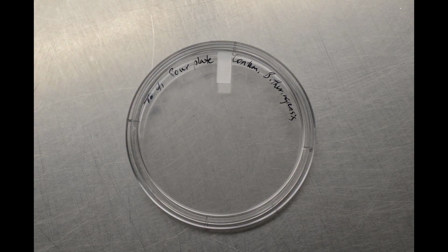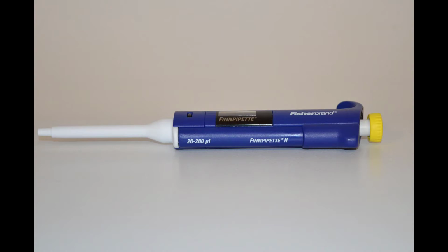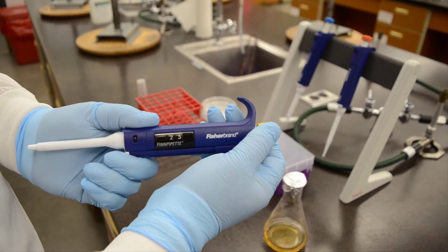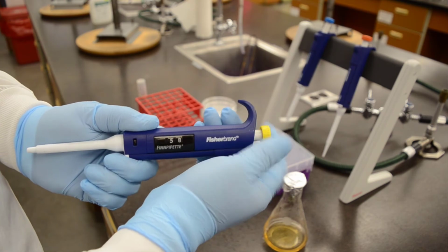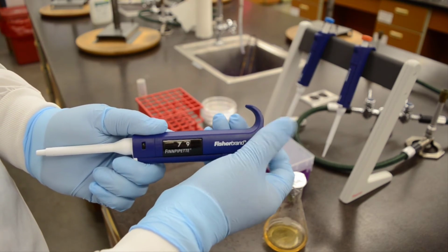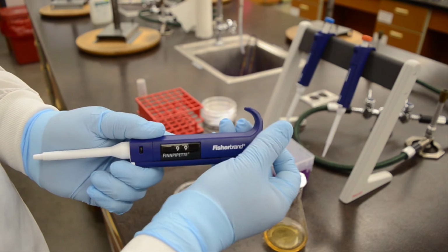First, we will need an empty sterile petri dish, labeled correctly as shown. You can see the initials, date, and a description of what will be in that plate. Today we will be using a micropipettor that has a working range of 20 to 200 microliters. Micropipettors are commonly referred to as having a size, which is almost always the upper limit of its range. So we would commonly call this a 200 microliter pipettor. We first need to adjust it so that it will dispense 100 microliters by rotating the adjustment knob until we see 100 in the window. You should never try to adjust a micropipettor beyond its working range.